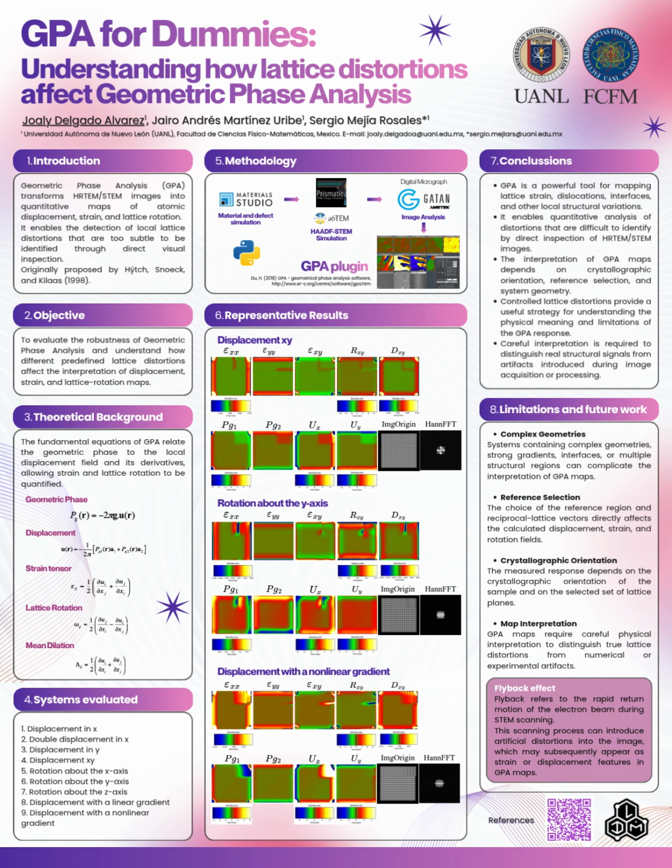These results also show that strong features frequently appear near the image boundaries. Such signals must be interpreted carefully because they may result from Fourier filtering, mask selection, periodicity assumptions, or other edge effects rather than from the intended lattice distortions.